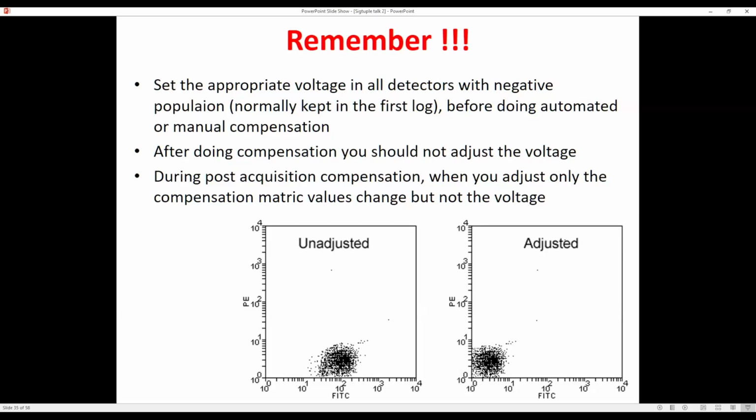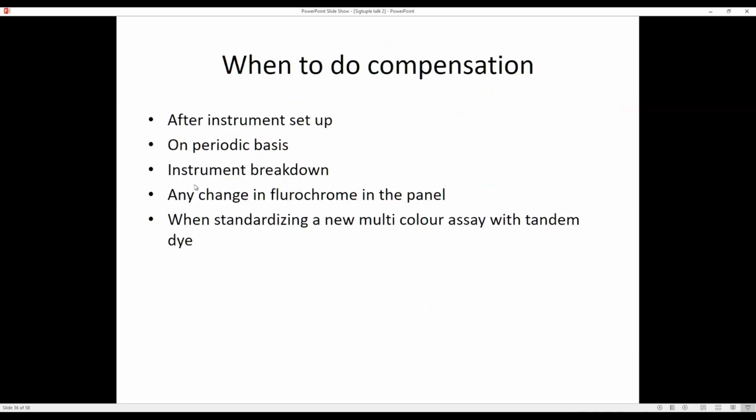Okay, so now coming to the other important question: when to do compensation? This is something people ask very frequently, right? Should I do it once a month? Should I do it once in 3 months, once in 6 months?